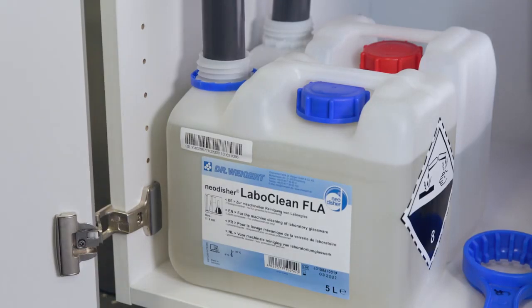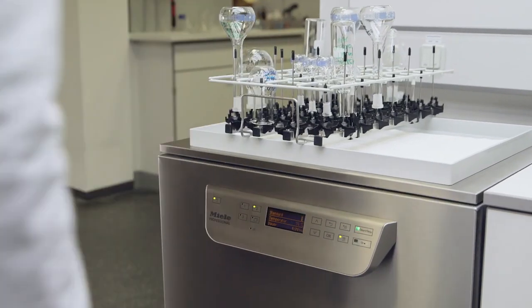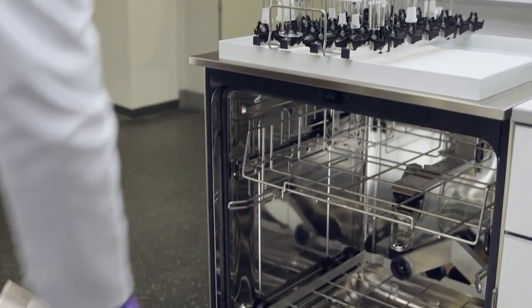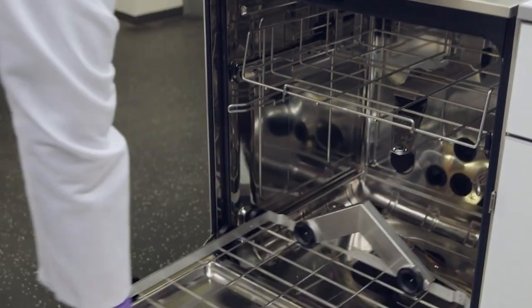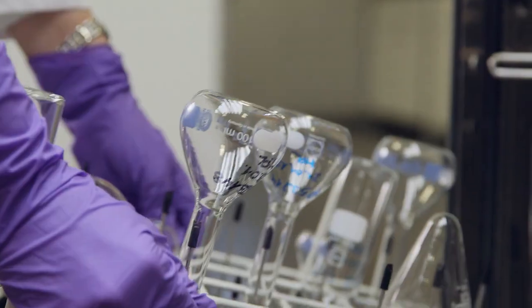Third, choosing the right process chemical and the right program parameters is decisive for the cleaning success. An alkaline, surfactant-free cleaner is best suited for automated cleaning, especially with black markers.